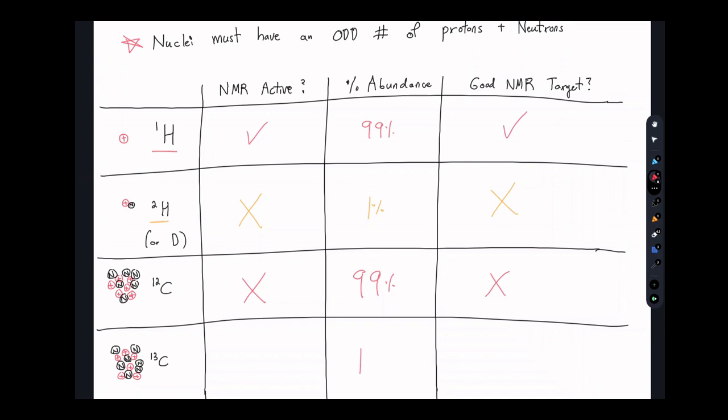However, 1% abundant is carbon-13, or the heavier isotope of carbon, which is used for carbon radio dating, and it is NMR active. Awesome. This makes it a good NMR target, but its low abundance can be a problem. Now, in this course, I'm going to focus entirely on 1H NMR, as it's by and large the most useful tool, and one that most universities will focus on entirely.